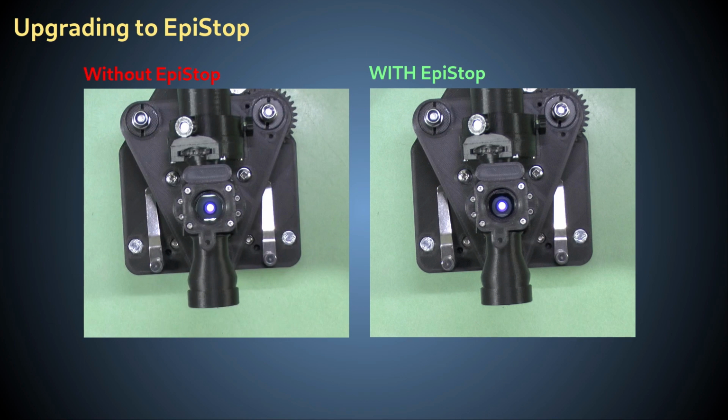This upgrade is essential for reflected light microscopy, but is optional for fluorescence, because with the latter we use an excitation light blocking filter above the beam splitter. However, even in fluorescence it may reduce some background light if your blocking filter is not 100% efficient.